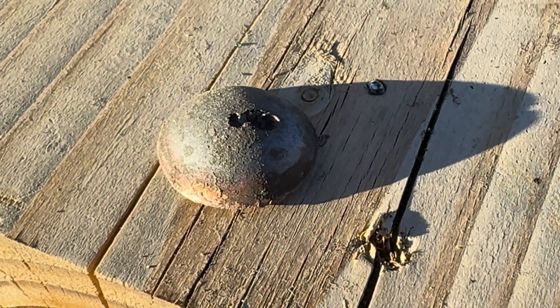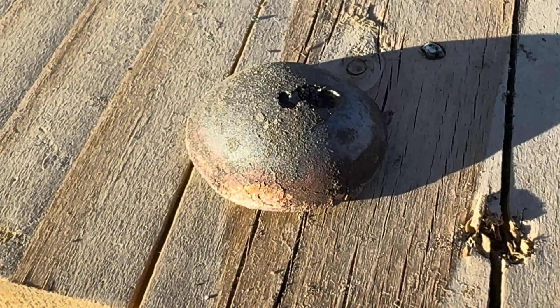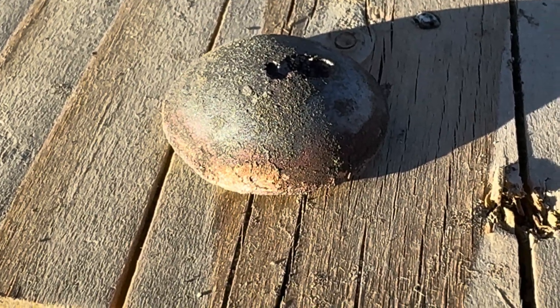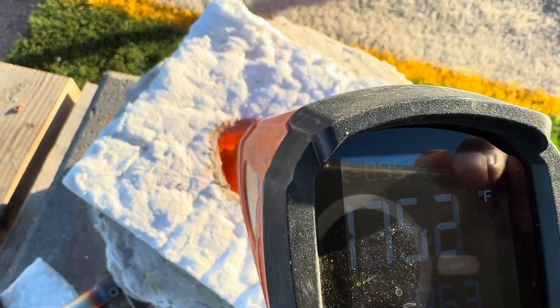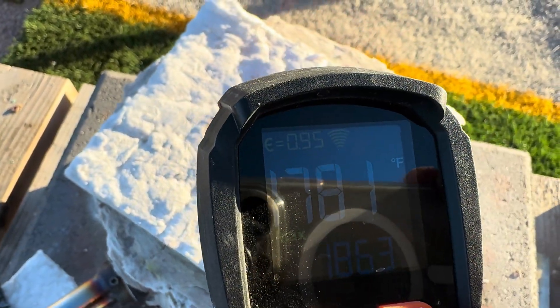So let's get to it. Here is our lead prill and you can see that there is a lot of copper on this prill. We have our cupel heated up to about 1,800 degrees.